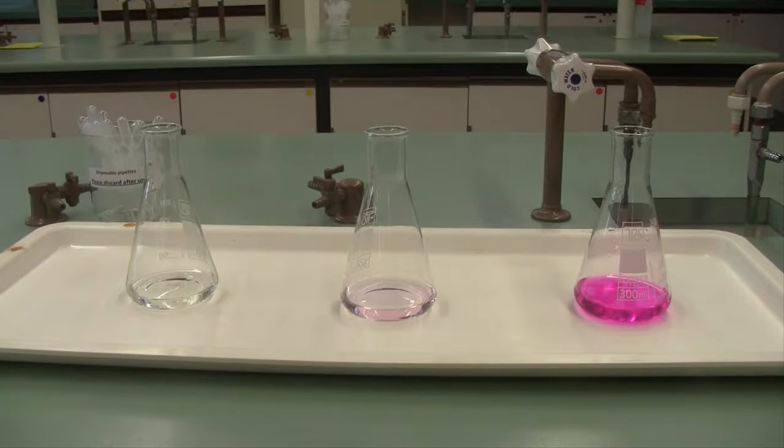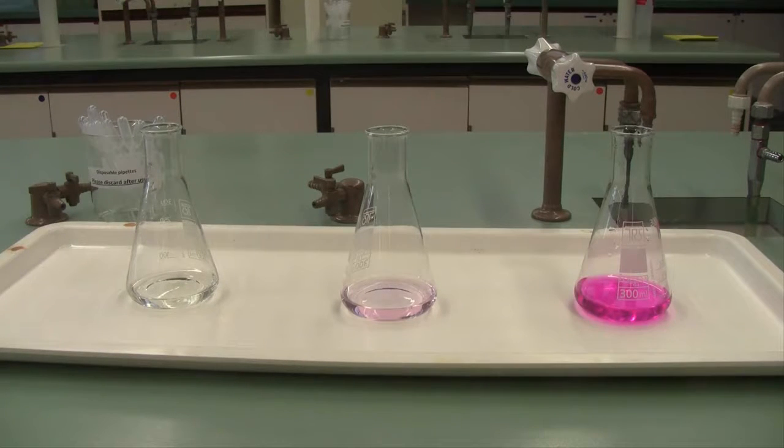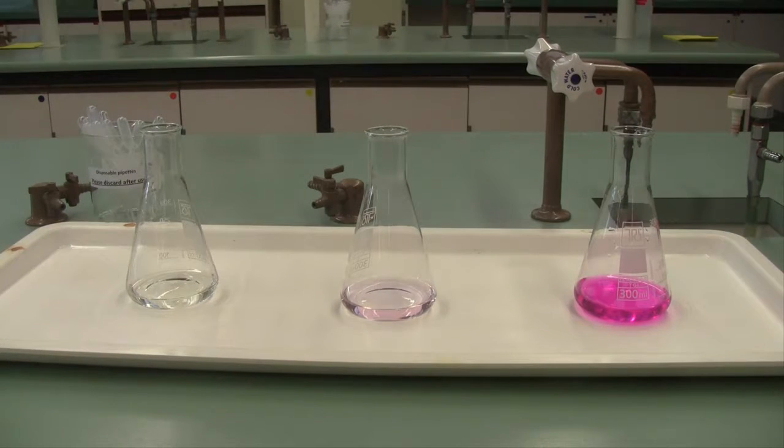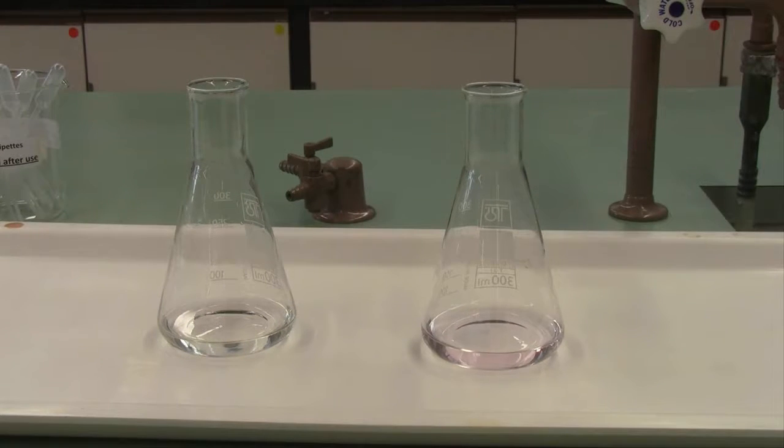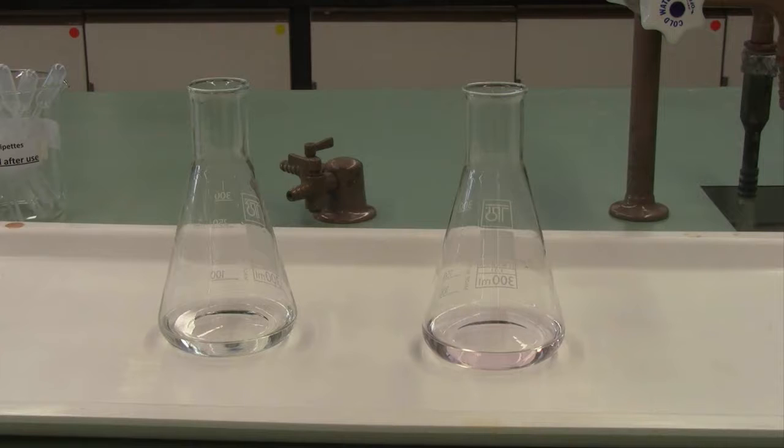The indicator is colorless to begin with. The faint light pink color in the middle is the color you're aiming for, and the bright pink at the end indicates that you have overshot the endpoint. So again emphasizing you want that first permanent faint light pink color to show you you're at the end of your titration.